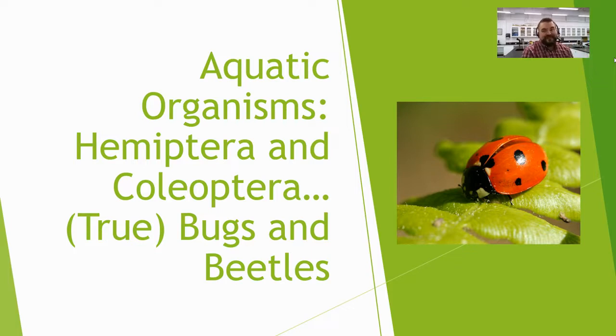I teach fisheries and some aquatics classes here at Lakeland College School of Environmental Science. I am joining you for this micro lab again from the tastefully appointed, recently renovated aquatics lab here at Lakeland. Today, I'm coming at you with a nice, quick microlab on some aquatic organisms. And today we're going to be talking about two groups, Hemiptera and Coleoptera.